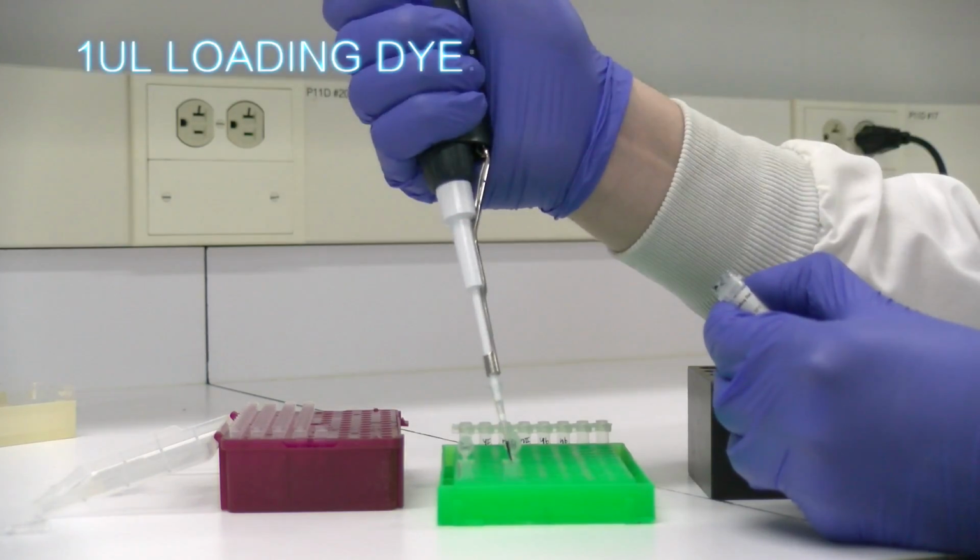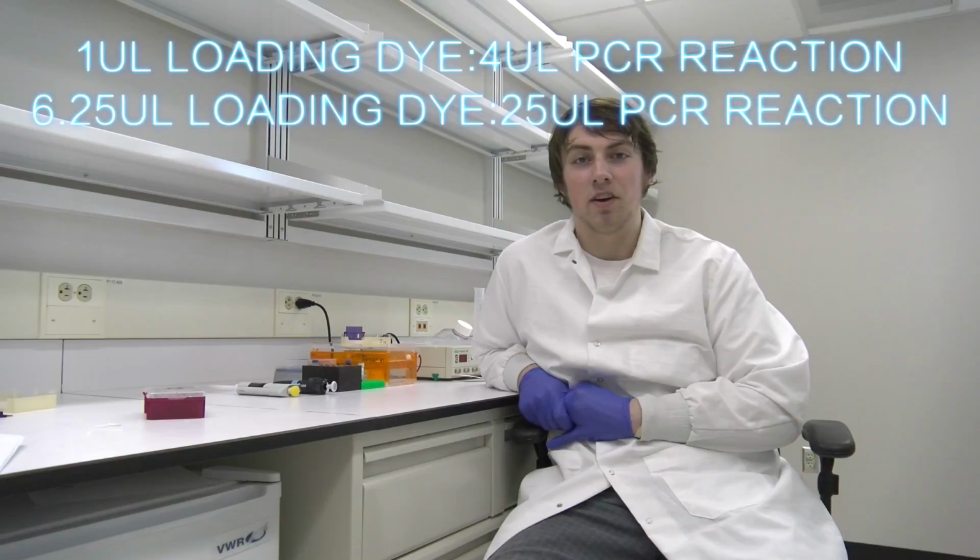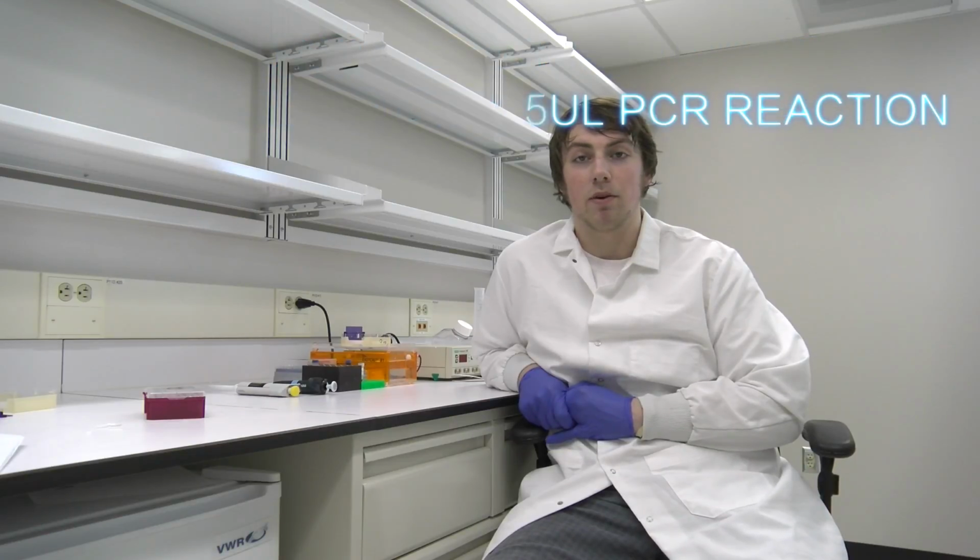In order to be seen in our ChemiDoc image, we need to add gel loading buffer to each of our samples. In this case, we will use Gel Pilot 5X loading dye. Add 1 volume of gel dye to 4 volumes of the sample. So in this case, it would be 6.25 microliters for every 25 microliter reaction.